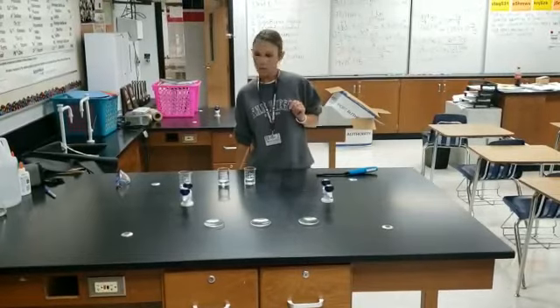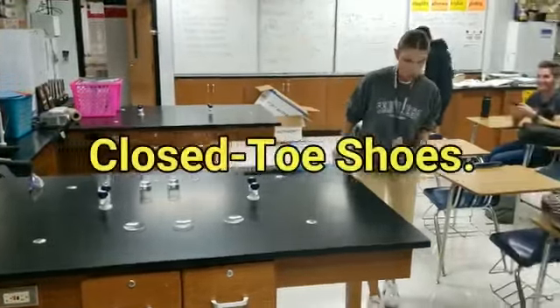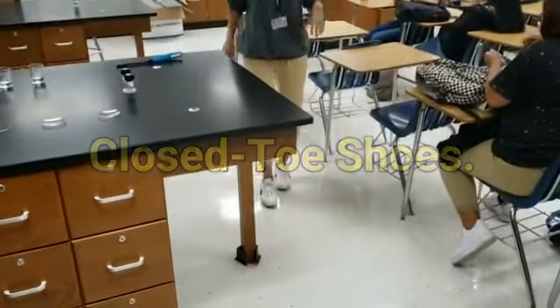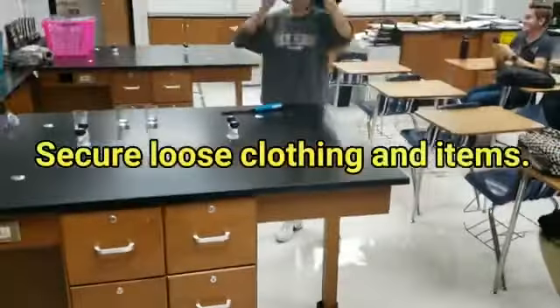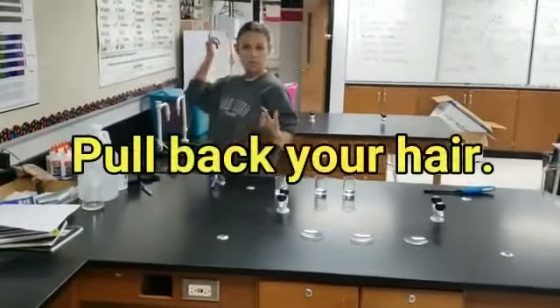So before I do anything, I need my proper lab attire. Closed-toe shoes are necessary. Also no dangling items, so I'm going to remove my ID so I don't cause any hazards. My hair is pulled back.